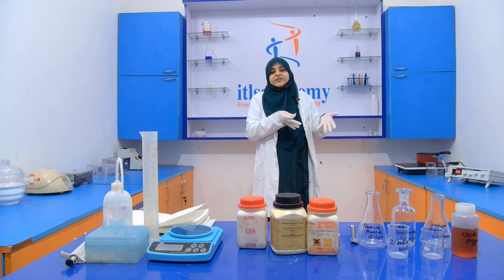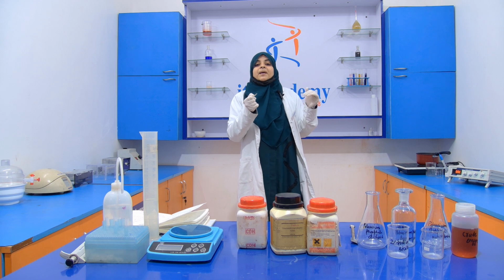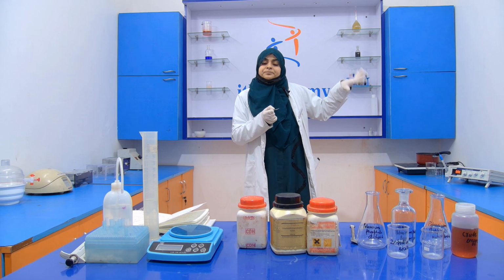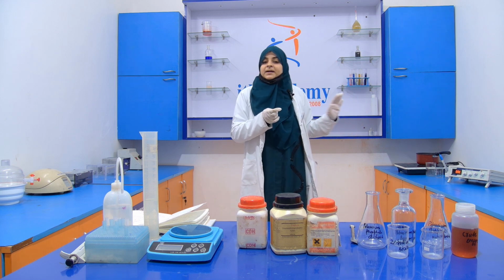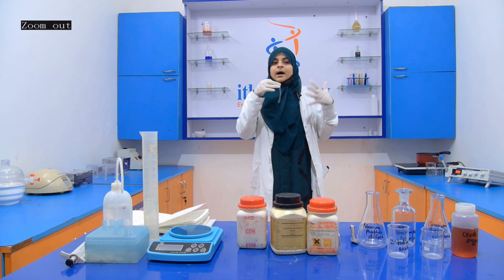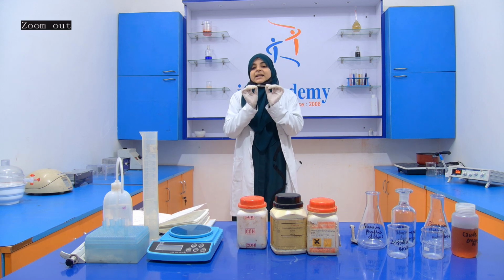Then again after 10 minutes, we remove this dialysis membrane from the boiling sodium bicarbonate. Then again we boil it in distilled water for 10 minutes. This is how we activate this dialysis membrane. So around 30 minutes is required for the activation of the dialysis membrane.